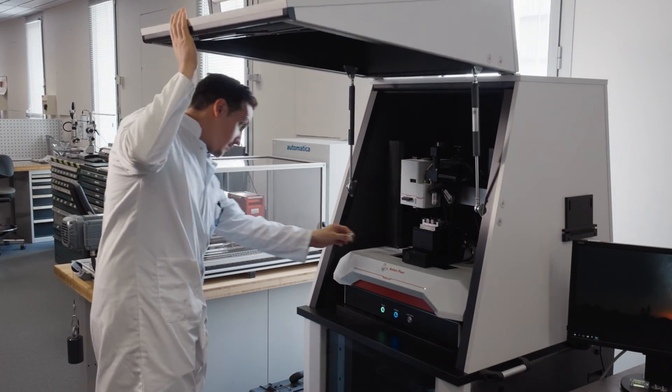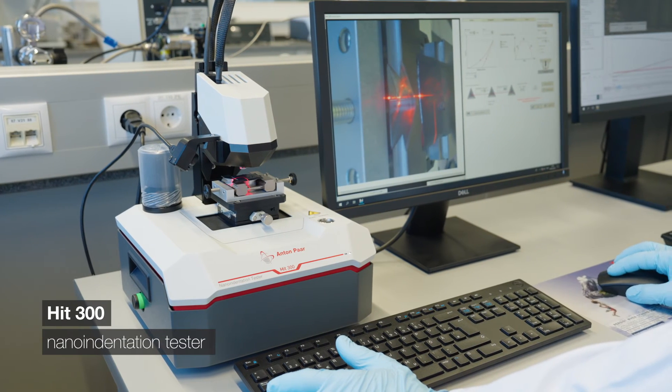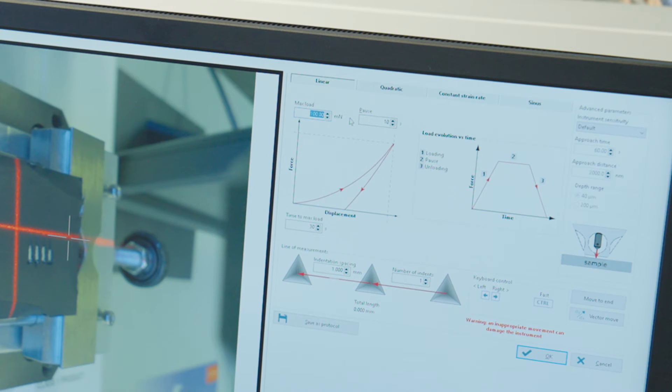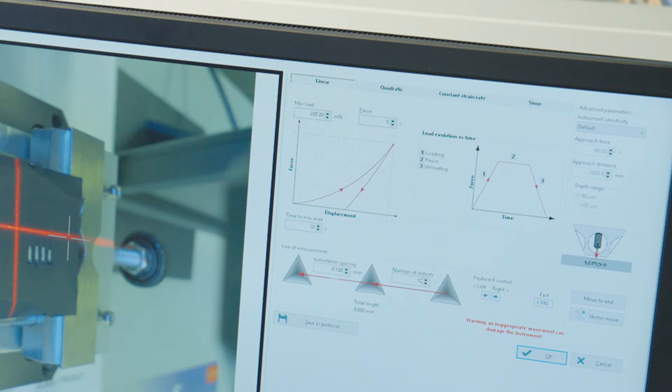While some floor-standing surface testing platforms can be equipped with heads that can do both scratch testing as well as nano indentation, it is also possible to use dedicated benchtop nano indenters. Here we will have a look at a benchtop instrument for nano indentation of electrode coatings. For this LFP cathode sample, an indentation force of 200 mN is applied with a loading rate of 1200 mN per minute. The loading rate is the speed at which you reach the maximum indentation force. We will also define the pause time at maximum load where we observe creep of the cathode coating. We also define the number of indentations as well as the spacing between them, which will be performed automatically without the need for user intervention.